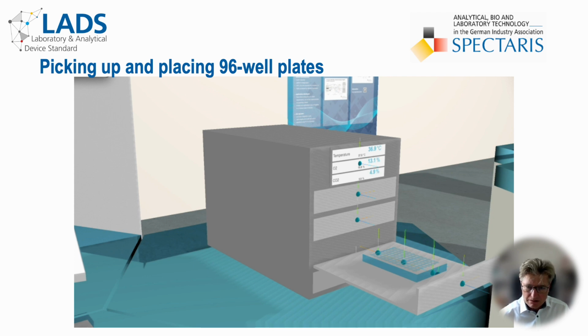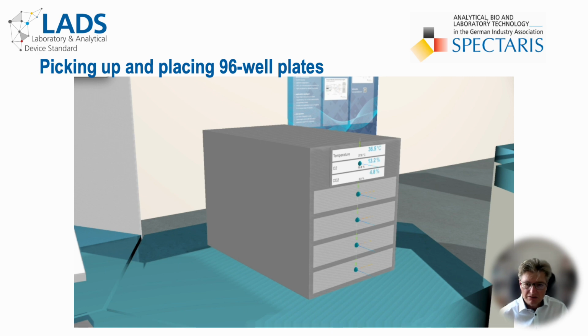The current position of the 96 well plate itself and its attachment points for the robot gripper are represented by the green spheres with their colored axes. Each green sphere in this scenario represents a relative spatial location object in the OPC UA information model or one of its attachment points. An invisible robot lifts up the 96 well plate, moves it away, and transports it to another location in the lab. The empty drawer closes and waits for the next plate to be inserted.